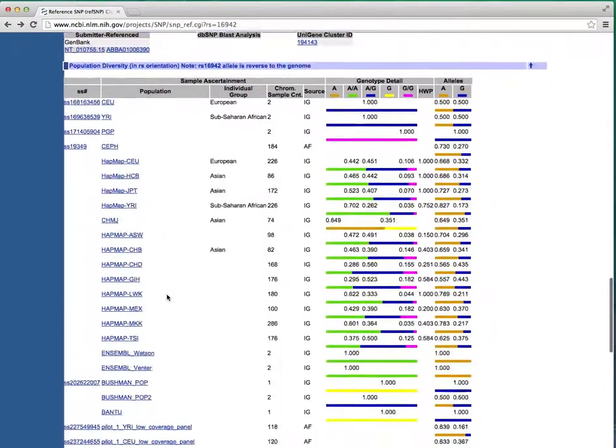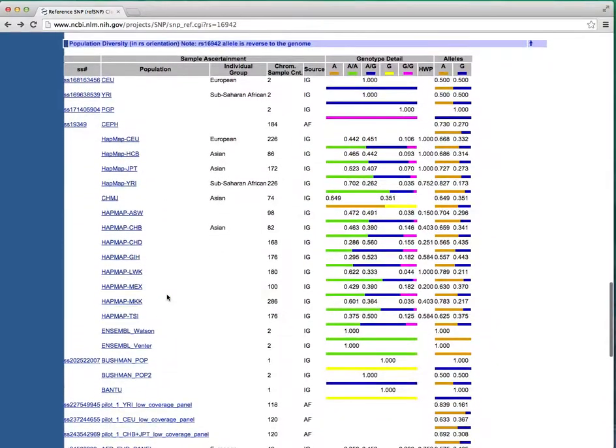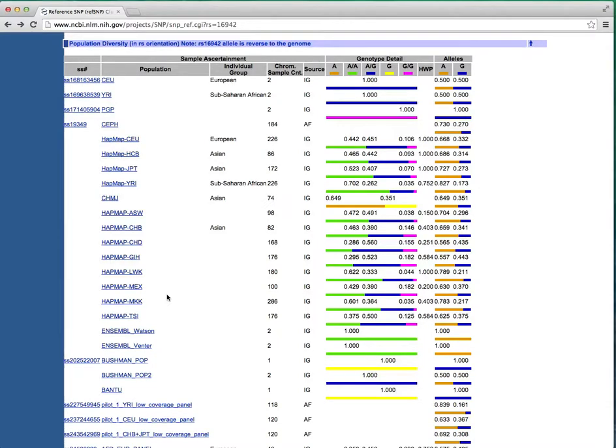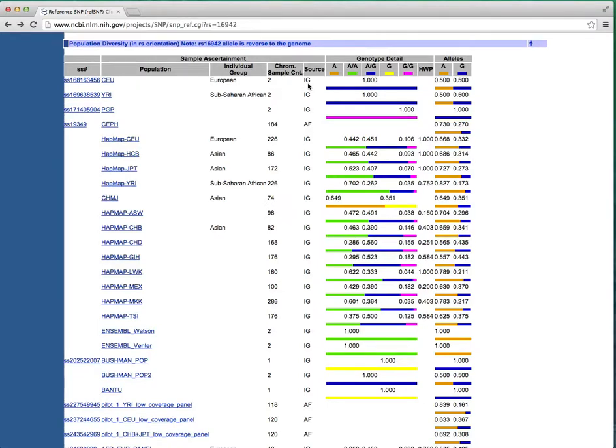Finally, let's examine the Population Diversity section. It will display all the submissions that provided frequency information. Each entry will give you a population and information on the ethnicity of that group if it exists, the number of chromosomes that went into the calculation, the source where IG stands for individual genotype, AF stands for allele frequency, and you don't see GF, but they also can supply genotype frequency.